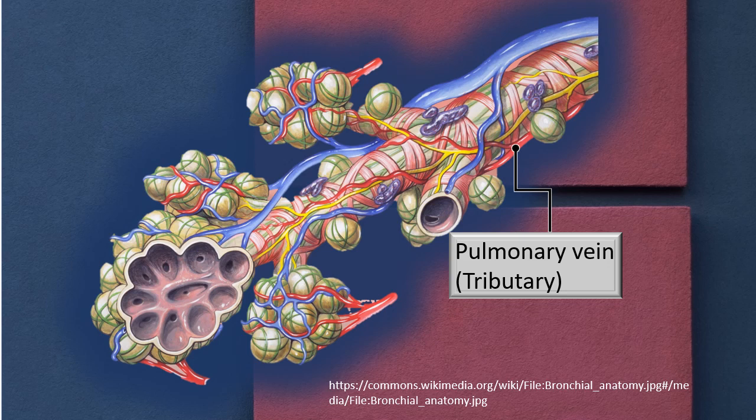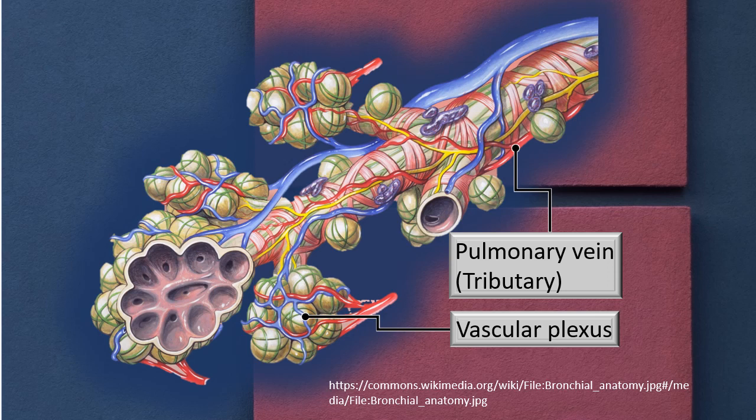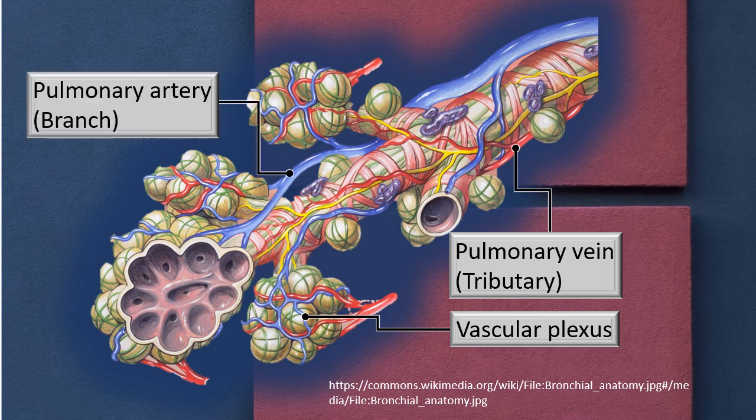When you look at the vascular architecture, it closely follows the bronchial tree. The red colored structure I have labeled is a tributary to the pulmonary vein. What is marked in blue is a branch of the pulmonary artery — mark my words, I have exchanged the color contrast, which is well known.